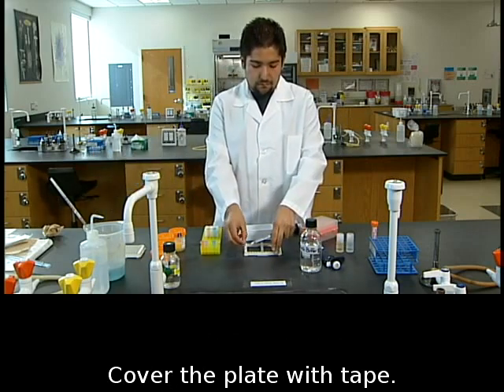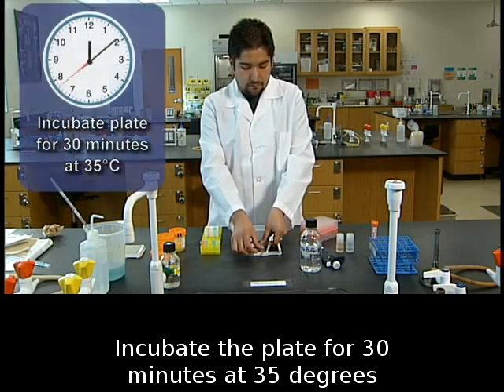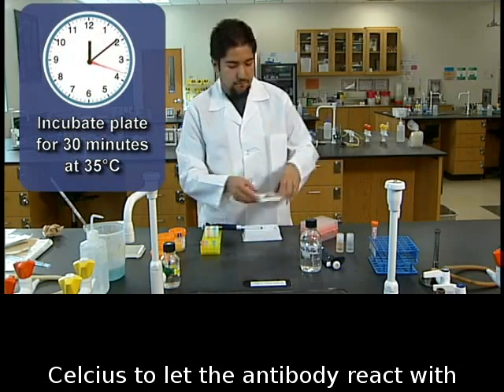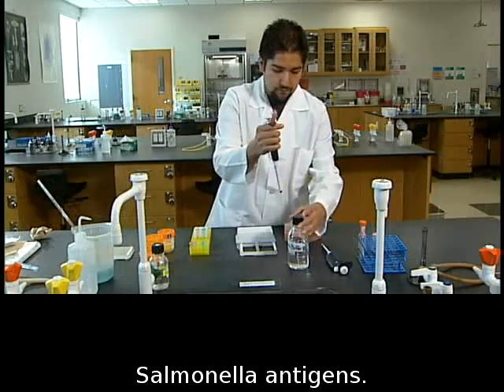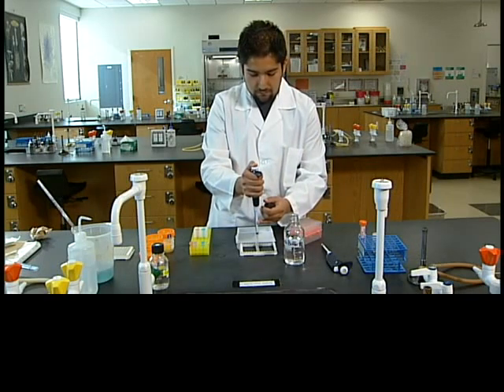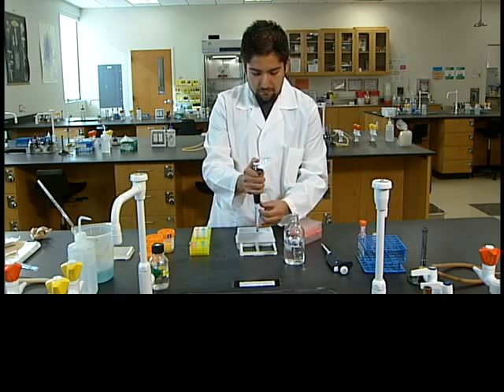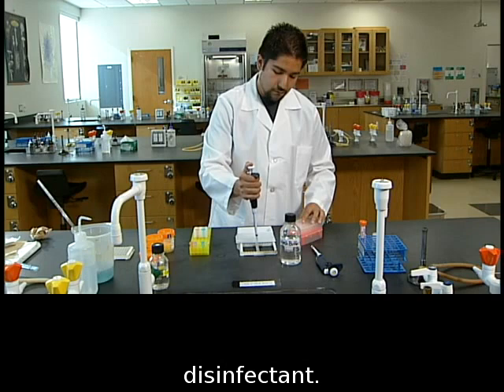Cover the plate with tape. Incubate the plate for 30 minutes at 35 degrees Celsius to let the antibody react with salmonella antigens. Add 50 microliters of washing buffer to each well and then remove the liquid and discard in disinfectant.